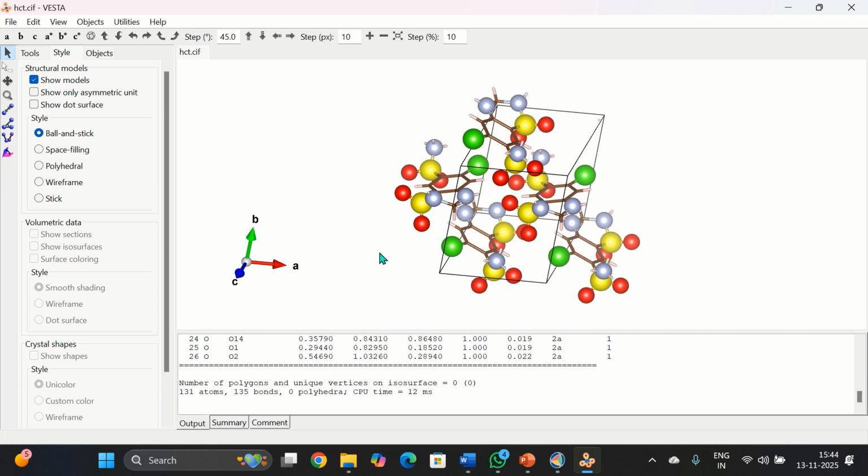It allows us to see the simulation of the entire crystal lattice, so that we clearly see how the molecules pack and interact inside the unit cell. Now it is time to finally, from the refined structural information, simulate the powder XRD, that is the X-ray diffraction pattern simulation.